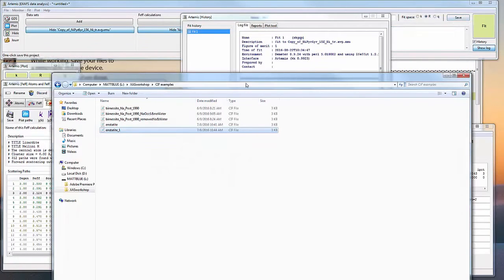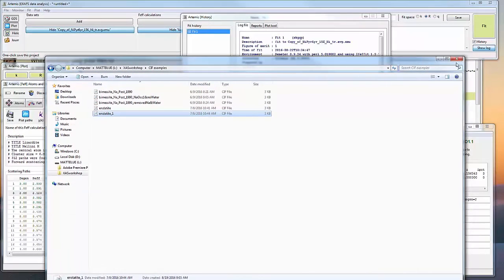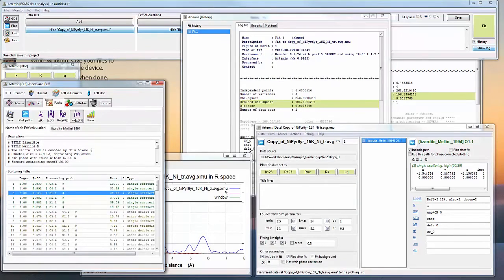And if you're just starting with this program, you might run into that problem, and it actually becomes a significant roadblock if you don't know how to deal with it, especially when you're just first getting started. So anyway, apart from that digression, let's get back to finishing up this sample.